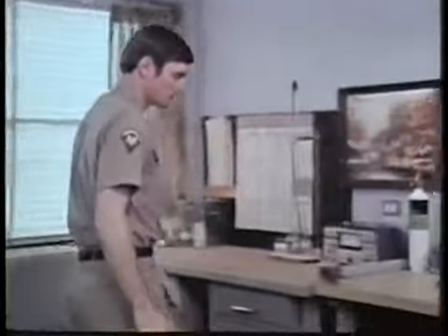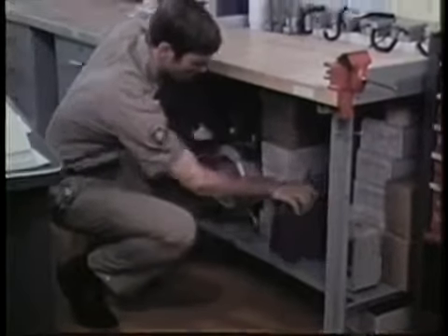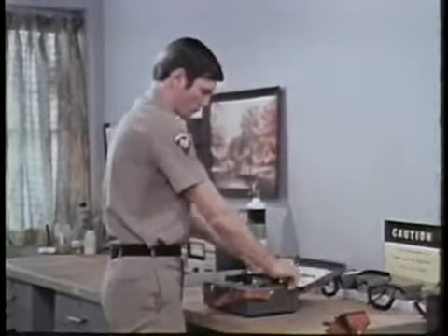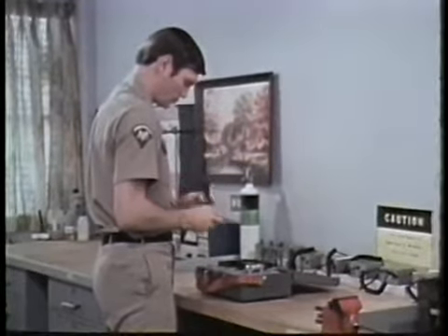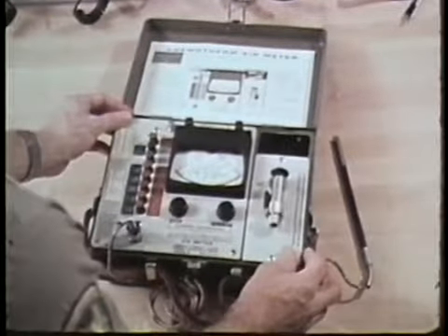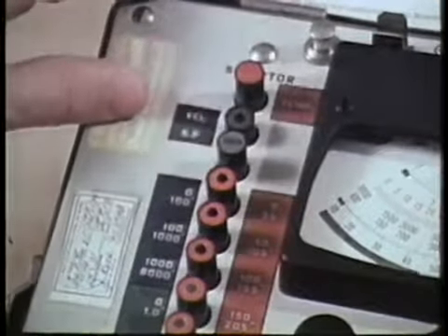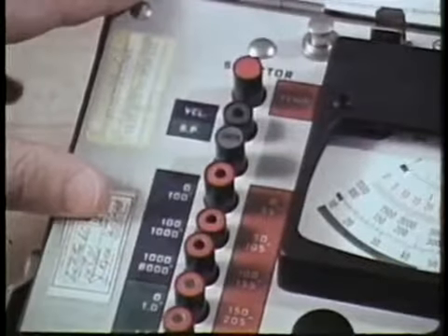Reviewing the data you've gathered, you then select the instruments you'll need to evaluate the work environments and prepare them for use. We'll go through the checkout procedures for these common instruments. First, the anemometer, or air velocity meter. To adjust the calibration, select the velocity and static pressure mode and the 100 to 1000 scale. Then hold down the check button.